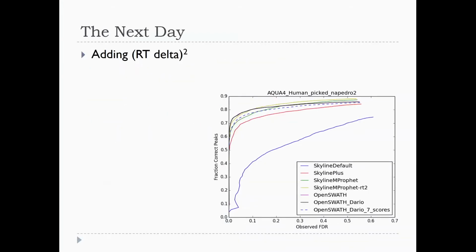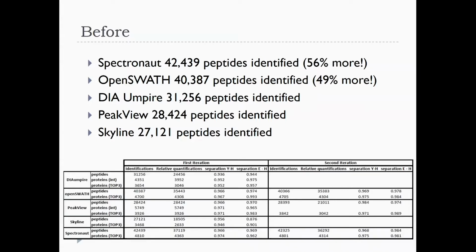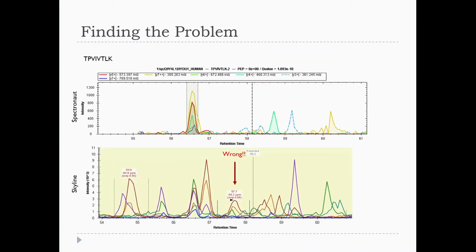And we had done enough of these curated experiments that we just don't ever see anything that big, like a 50. That's huge. So I went and did exactly the same question that I just told you: show me something that one tool got a really high score on and Skyline got a crappy score on. This was the biggest difference in score. I sorted by scores and actually wrote a delta of scores in Excel, then sorted by the delta and asked, what's the biggest delta? And this was it.